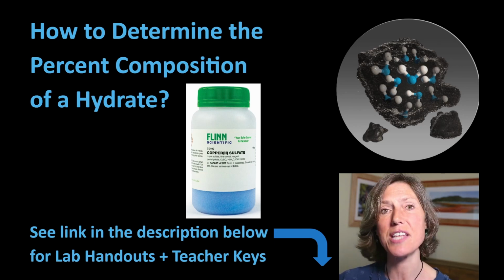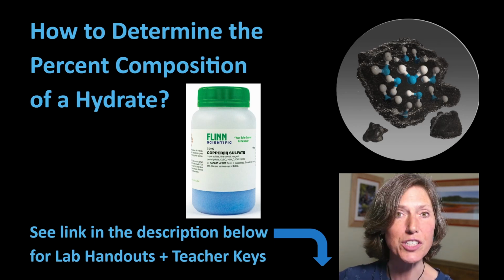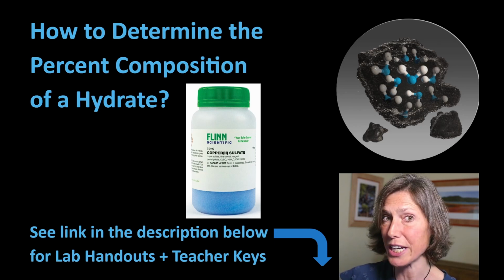It gave my students that extra step to take that rock, to take those crystals and grind it up, and therefore I felt they were more involved in the process of trying to get that water out. First step is to increase that surface area of the crystals by turning it into powder.